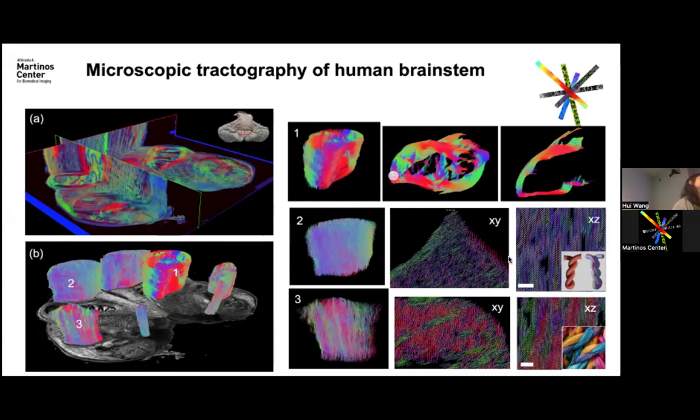That's a very good question. So far we don't have validation yet, because the only knowledge we have is from histology and neuroanatomy, how the bundles go from histology studies. But regarding individual fiber bundles, we don't really know if they really go this way. But we are getting there for a true validation, in the new project.